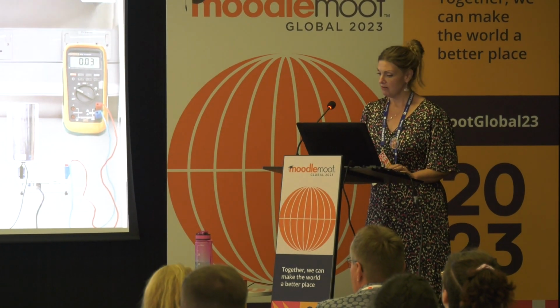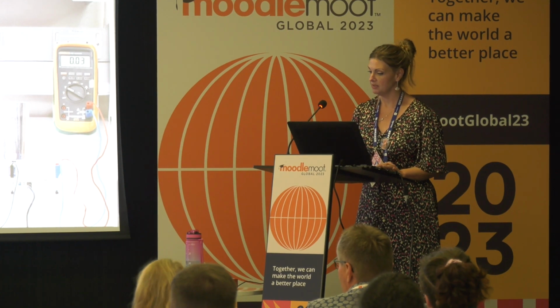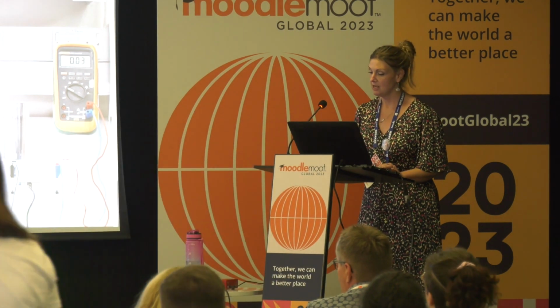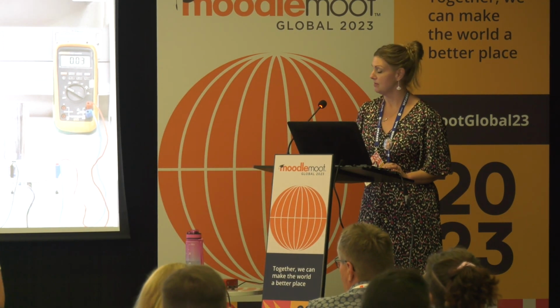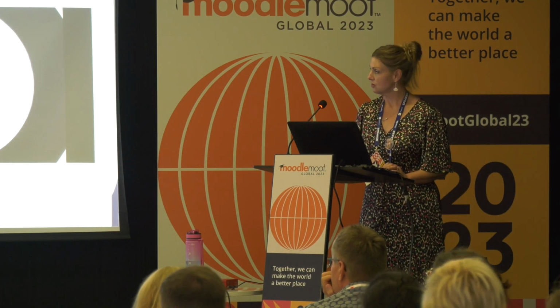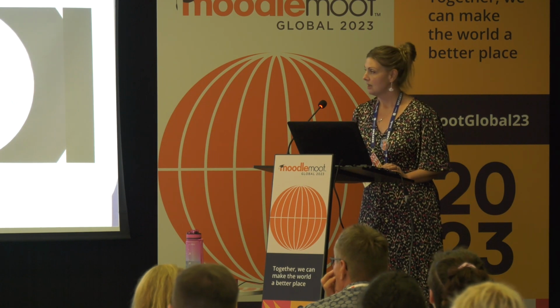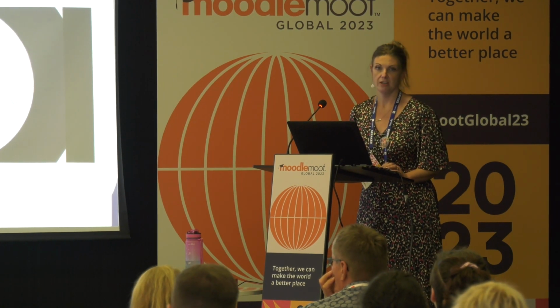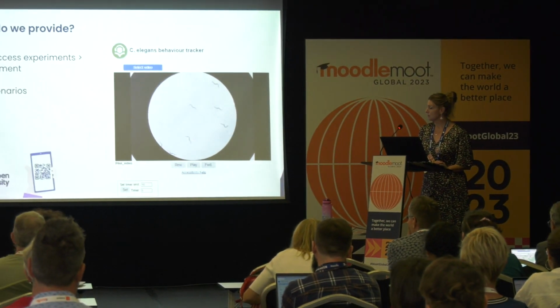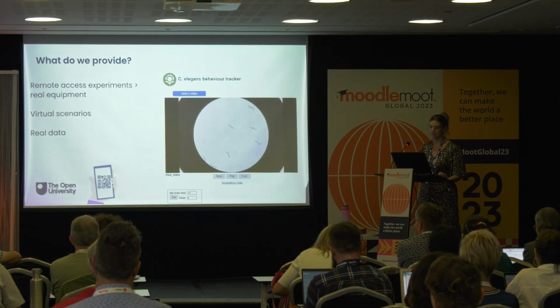We use virtual scenarios for students to study using data collected from live experiments, so they can enter their own parameters into different virtual pieces of kit, and they can determine their results. We've got real data to compare and contrast different samples, for example, rocks and fossil imagery, or microscope slides of cells and plant life. We also use quantitative data sets, videos, samples, that sort of thing.